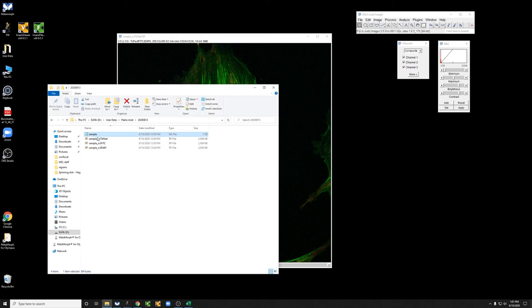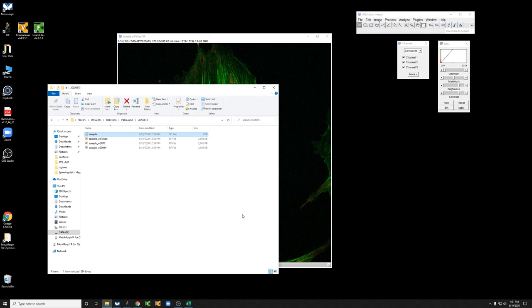But I just wanted to show you that by dragging these ND files into Fiji, you can very quickly take a look at these images. So let's go back to Metamorph.